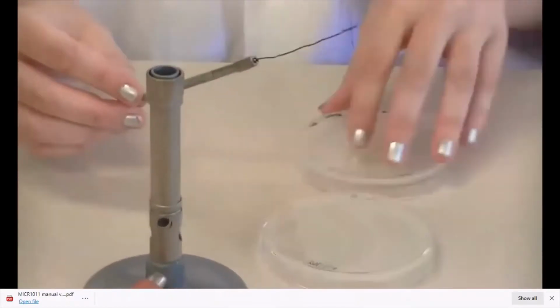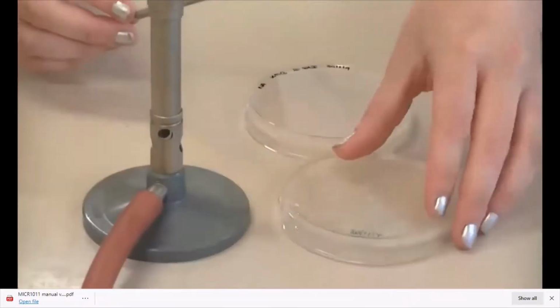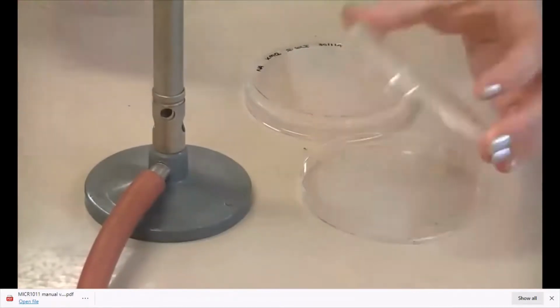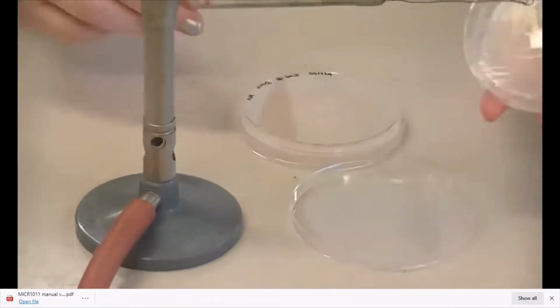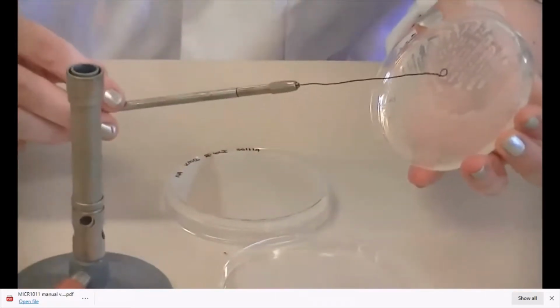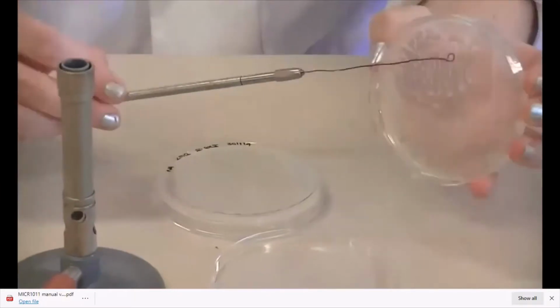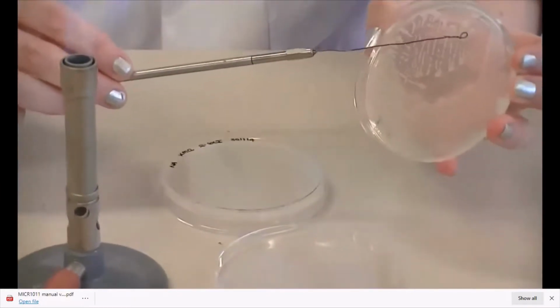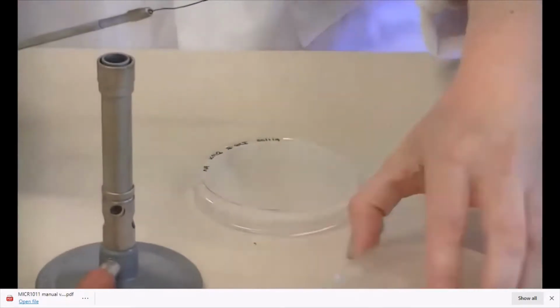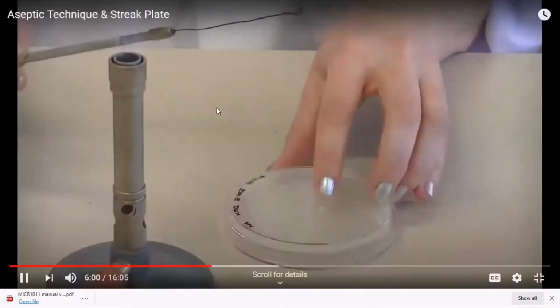In this example, I have some E. coli on a solid medium. Now my loop is sterile and cool enough. I'll just check by touching it to the surface of the plate. It didn't sizzle, so it's ready to be used. You want to collect a single colony from this plate and transfer it onto your new sterile agar plate.